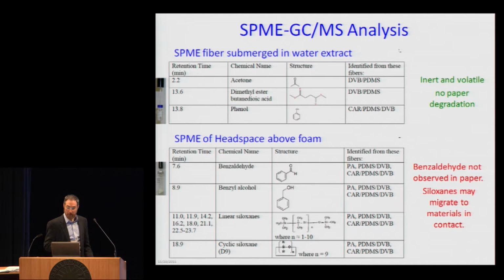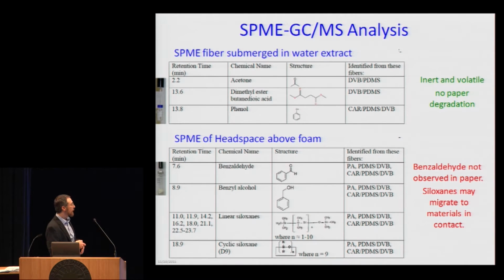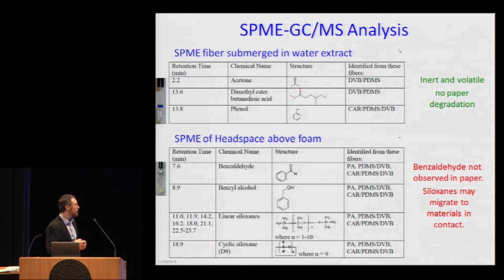And so I went ahead and did those tests very similar to Chris with SPME. And of the water extract, remember this is only the stuff that's in the paper and is soluble in water. So it had to act like a sponge, go into the paper, and then come out into the water, and I found more or less that these are relatively inert compounds and that there was no paper degradation. That said, this can, over time, potentially turn into an acid if you have the right conditions. Acetone is not a great thing to have around, but it's not going to cause necessarily corrosion or paper degradation. And then phenol also can change its form and do things, but it's more or less an alcohol and will, in all these cases, be volatile. So if you're sweeping air through your case, you can remove these things.